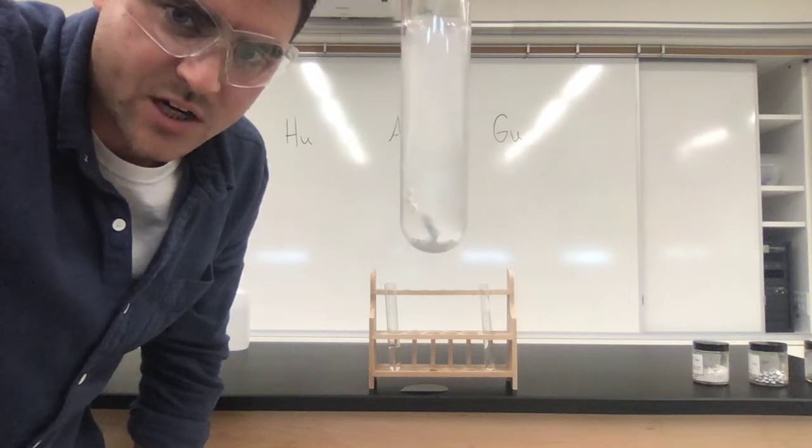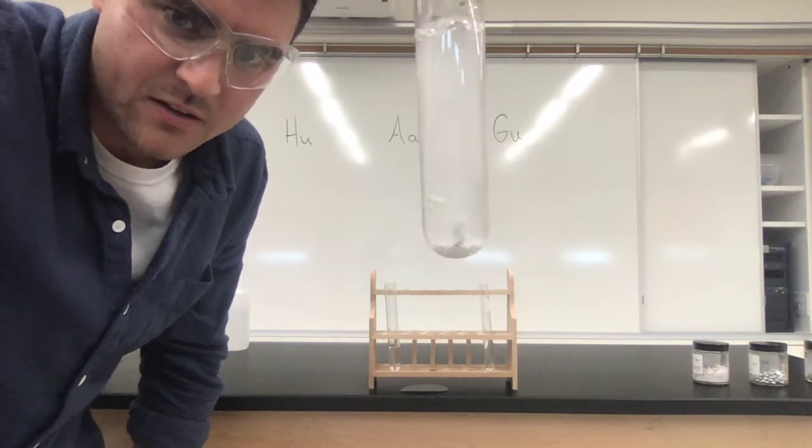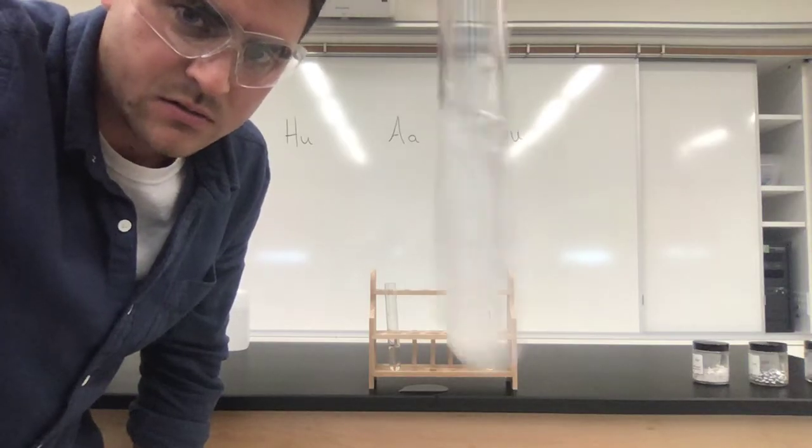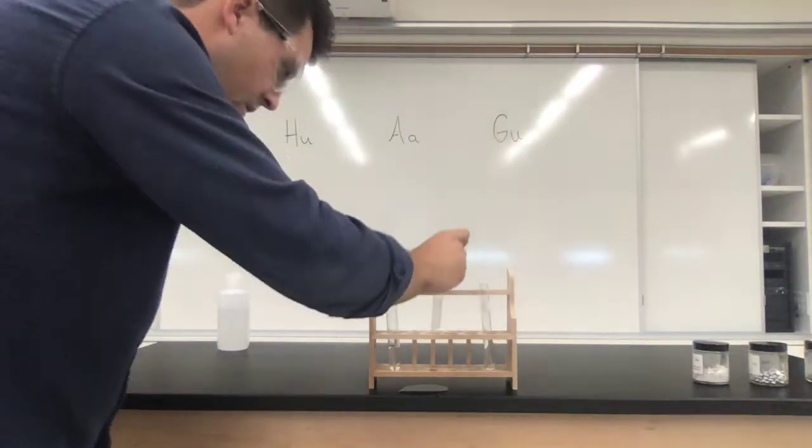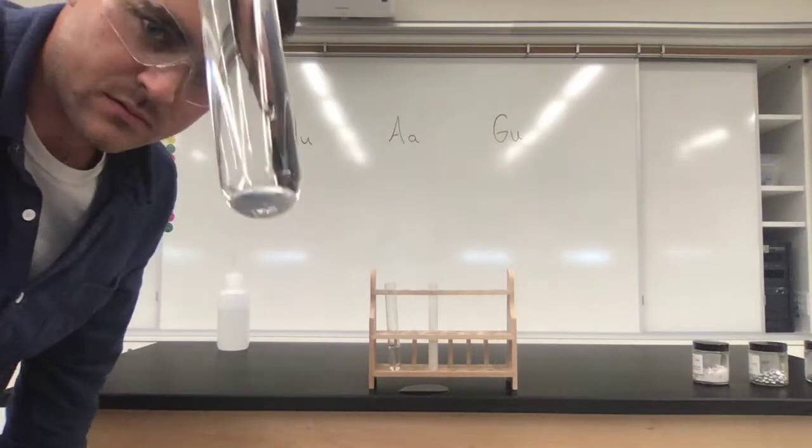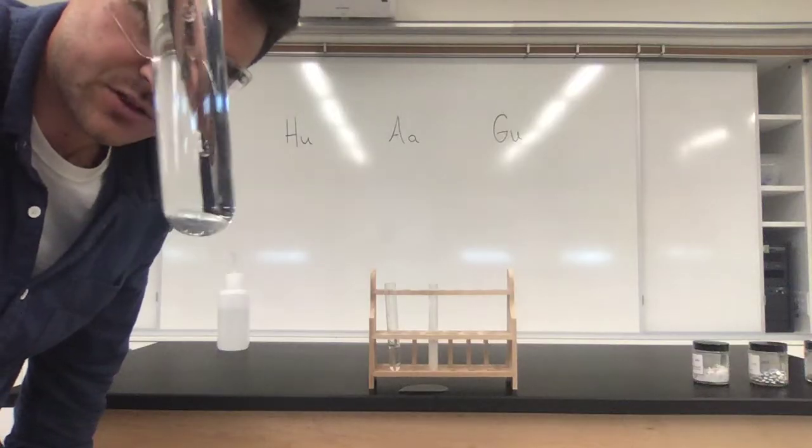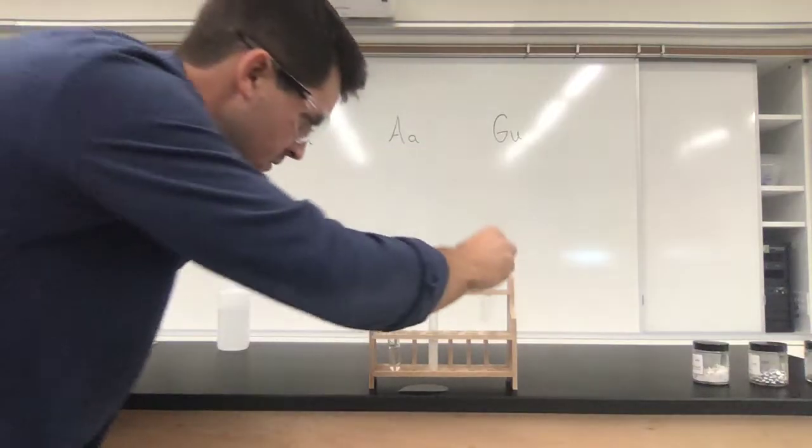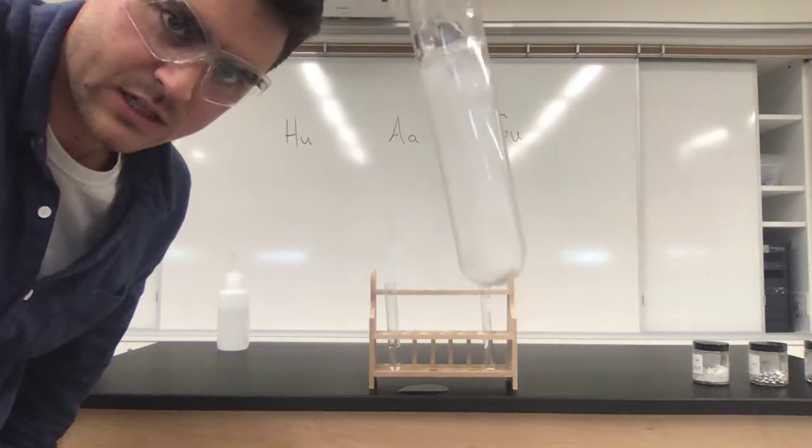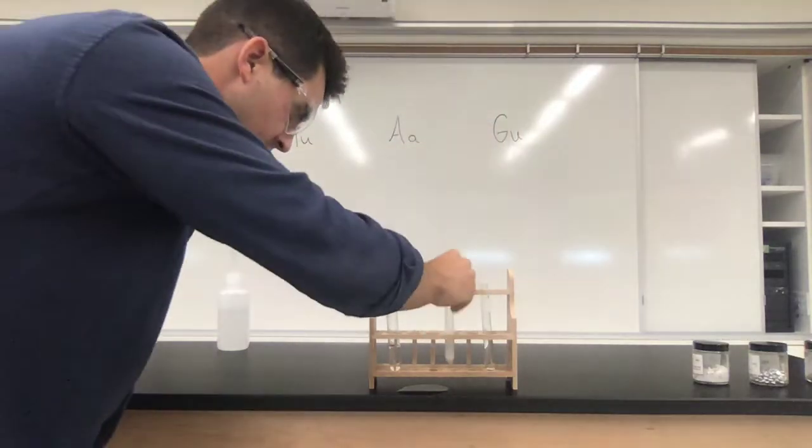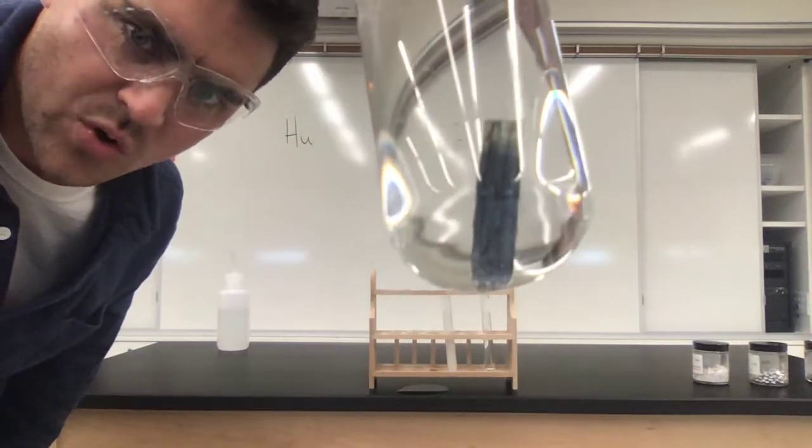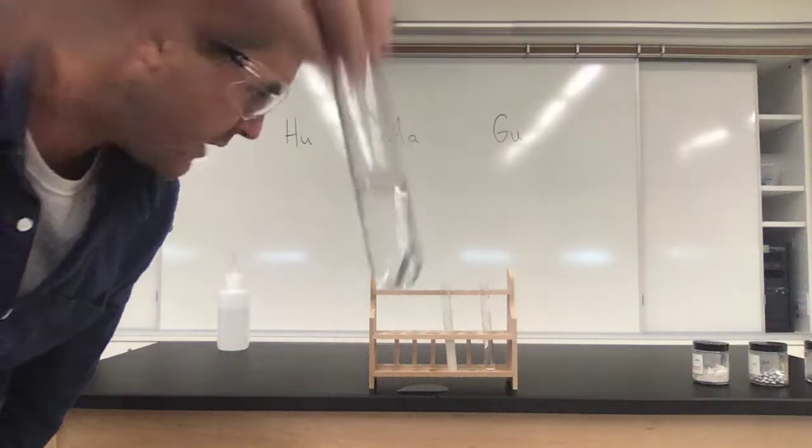Oh, look. I don't feel any temperature change. Look, it's getting... You can't even see through it anymore. Whoa. This thing is reacting. Cool. Oh, look, it's dancing around in there. You see it moving around? Wow. Oh, there it goes. Cool. Let's check back in with Gustonium to see if anything happened. Yeah, still no. Just like nothing. Walonium? Still going nuts. Look at that thing. Bubbling like crazy. Higsmith? A few more bubbles on there, but nothing like Walonium.